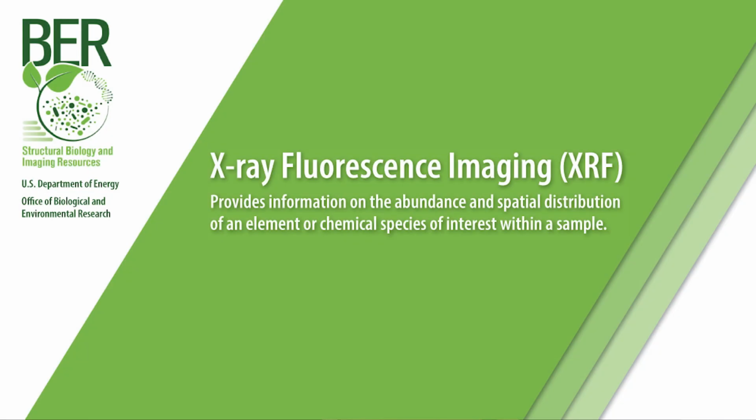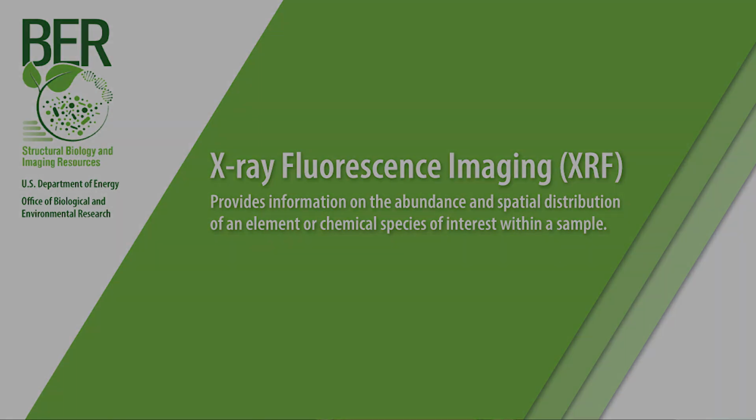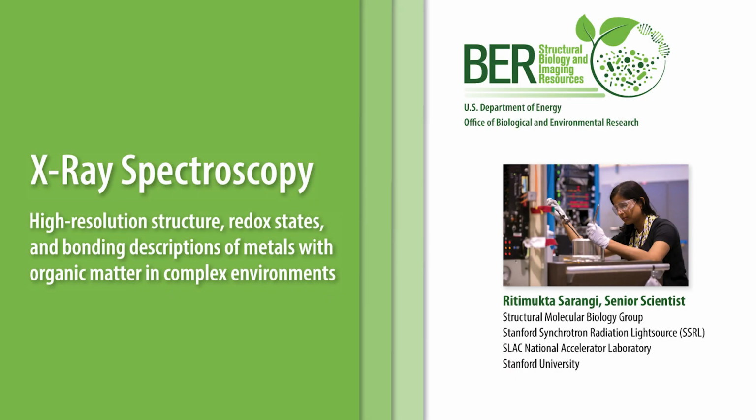X-ray fluorescence imaging provides information on the abundance and spatial distribution of an element or chemical species of interest within a sample. Most XRF imaging beamlines also have X-ray absorption spectroscopy capabilities, which probes an element's bonding properties. Information on the different types of X-ray absorption spectroscopy can be found in the X-ray absorption spectroscopy explainer video.